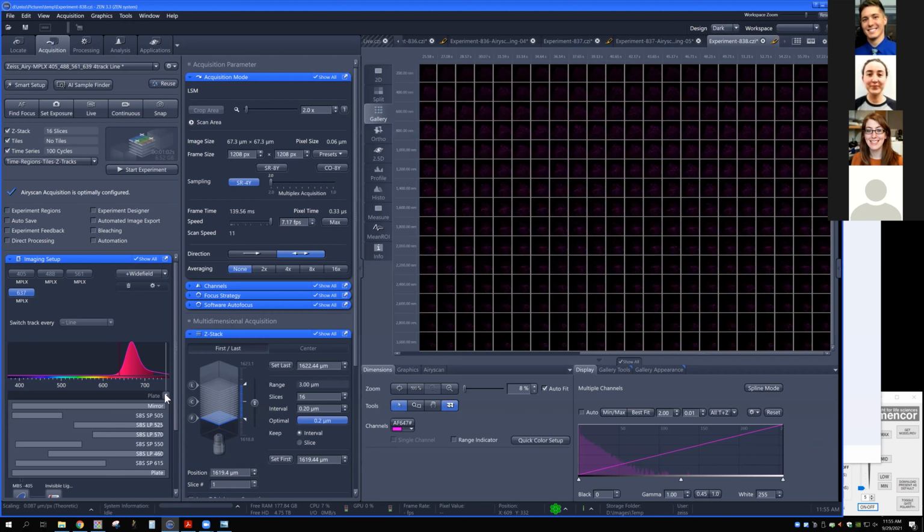And so that's the reason why we have, first of all, a mirror. This would be confocal. Plate is everything goes to the Airyscan. And then there's a couple of different short and long pass filter options here as well. So let's go do this for the green. Let's say for green, for example, that I want to do something like a long pass 525. Not a good idea, not the best choice. Maybe I'll pick the long pass 460 or the short pass 615.